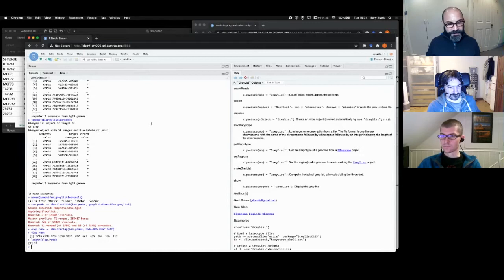Okay. What this is showing is how many merged peaks are in at least one sample. This is how many peaks are in at least 2 samples, so it's been identified twice. This is how many were identified in at least 3 samples, all the way to the ones that were in all 11 samples. There's only 119, right? So this is our universe here of 3743.